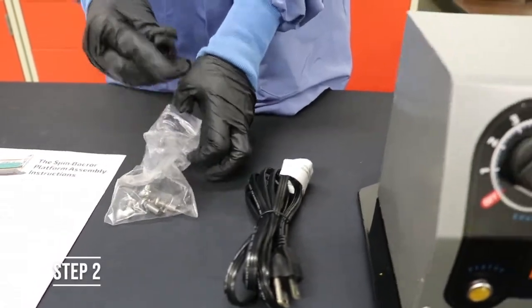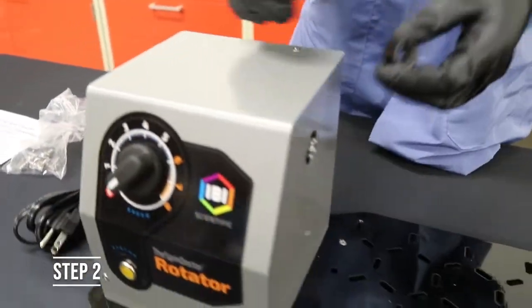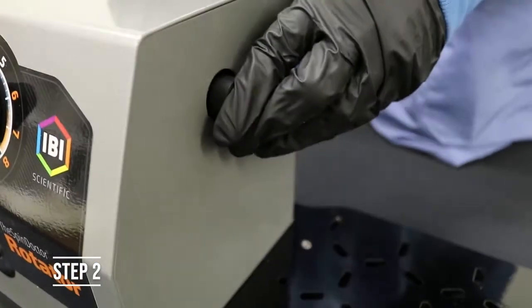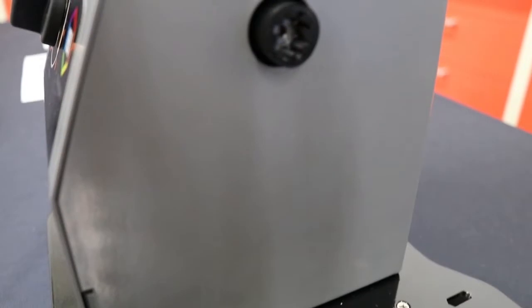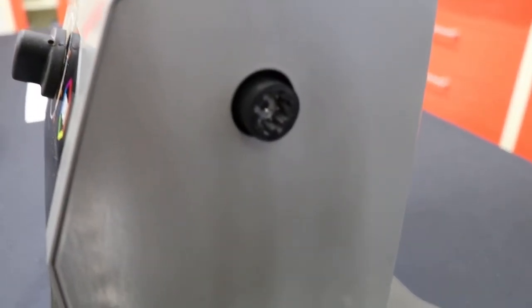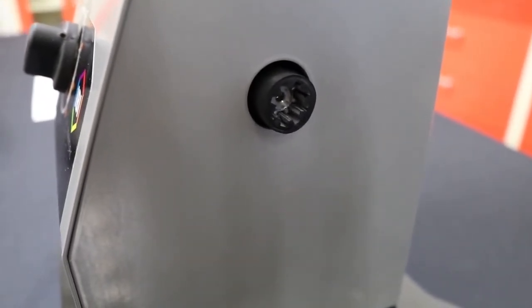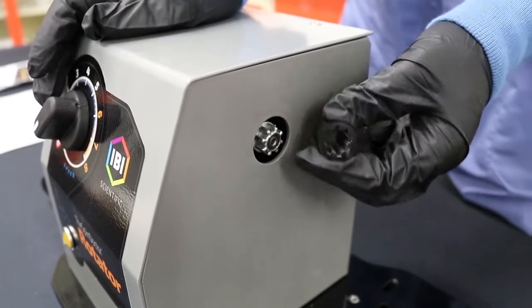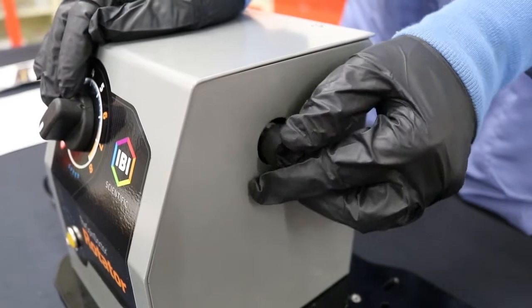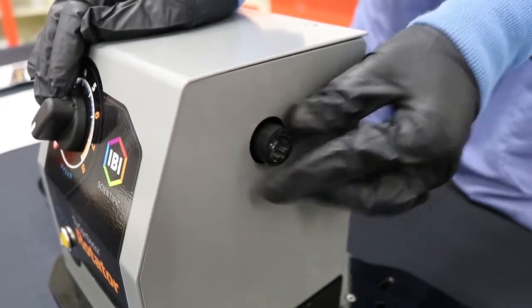Step 2. Remove the rubber drive coupler from the small bag and place it on the motor output shaft. You will notice a gear type pattern that must be aligned in order to insert the rubber motor coupler onto the motor shaft properly. The rubber coupler should press onto the shaft far enough so that the ribs of the mating part are no longer showing.